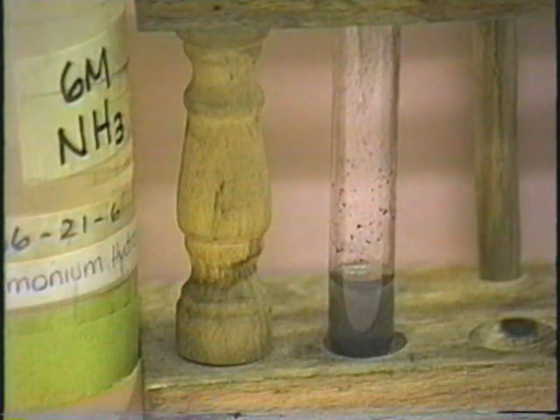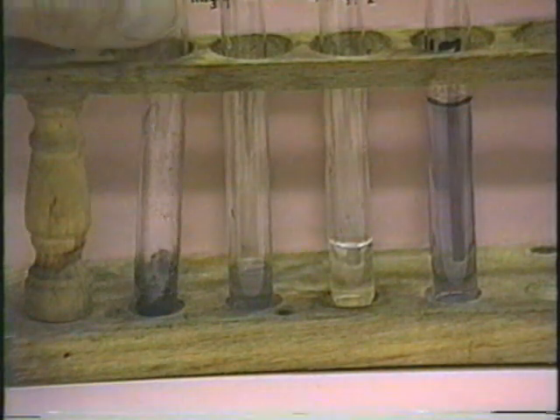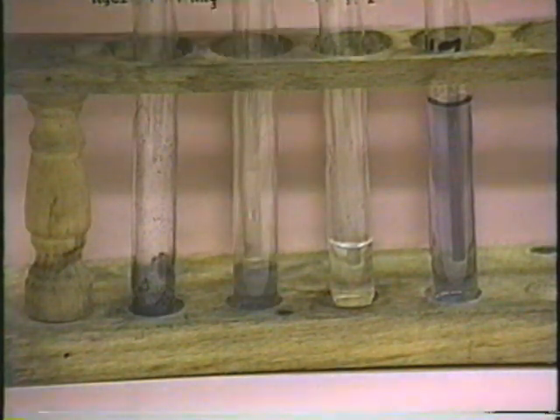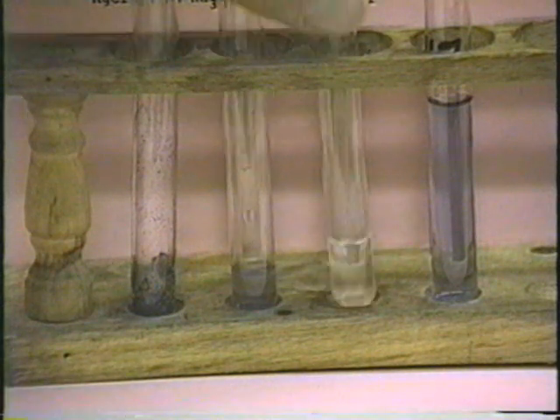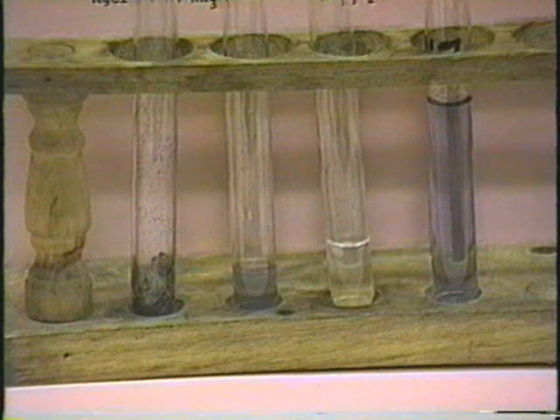Now we'll centrifuge this and test the supernatant liquid for silver. At this point, we've completed the separation of ions. This tube contains any mercury, this tube contains any silver, and this tube contains any lead. And we're now starting the confirmation tests.